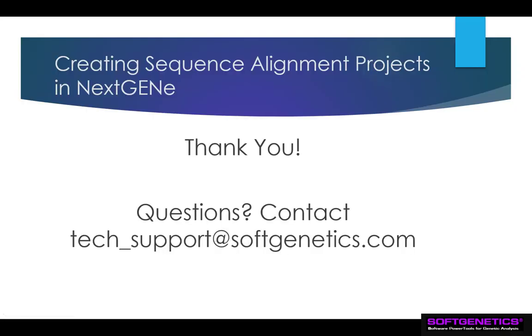We've now covered the information you need to start creating sequence alignment projects with NextGENE, from first importing a reference to setting up the analysis with either the project wizard or the AutoRun tool. Keep in mind, more details for the AutoRun tool can be found in the Creating Projects with the NextGENE AutoRun Tool webinar.